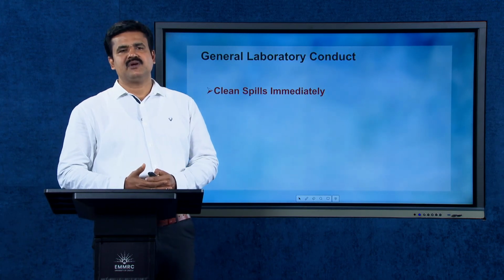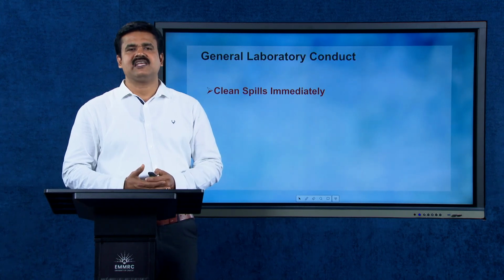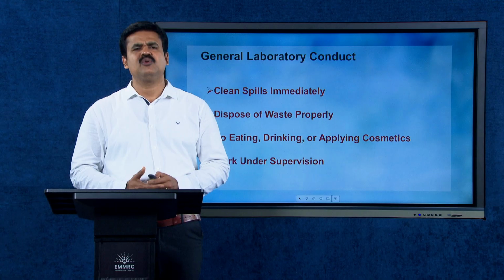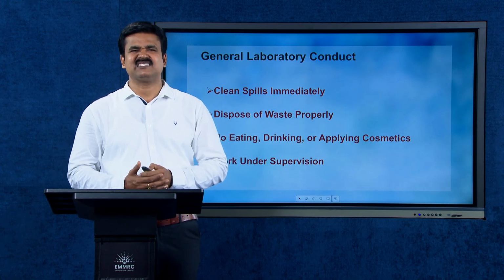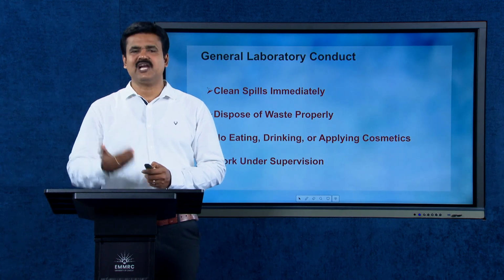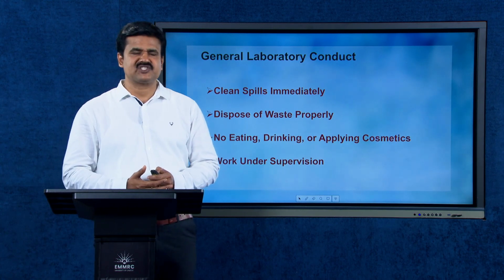Now we are focusing on the rules for general laboratory conduct. Clean spills and splashes immediately. Dispose of waste properly. No eating, drinking or application of cosmetics in the laboratory is very essential, and work under supervision. These are some common laboratory conduct rules, or important concerns that we have to adopt whenever we are working in a chemistry laboratory.